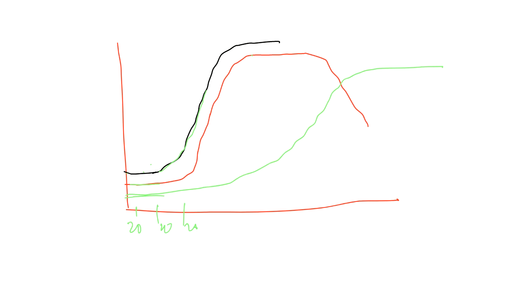And you're supposed to tell which one grows the fastest, which one grows the slowest, based on, again, the absorbance OD value versus time. Okay. And actually you get a graph and everything.